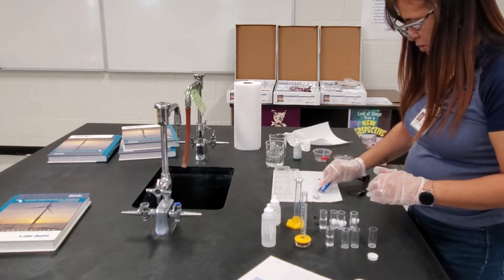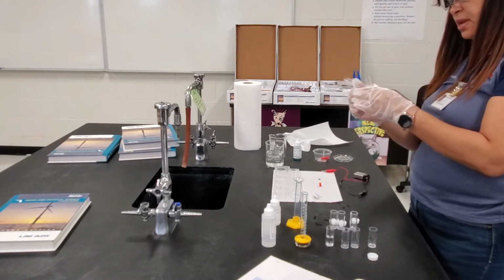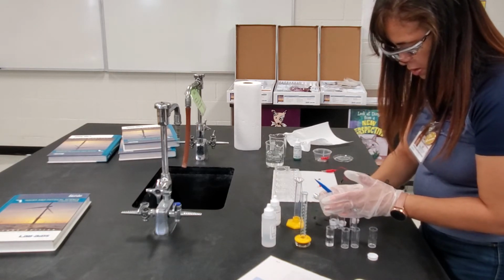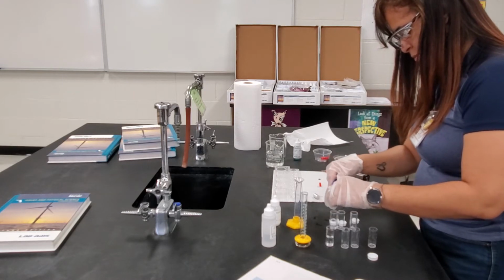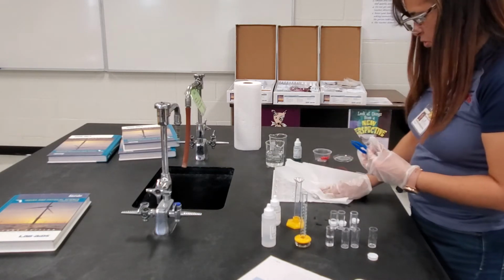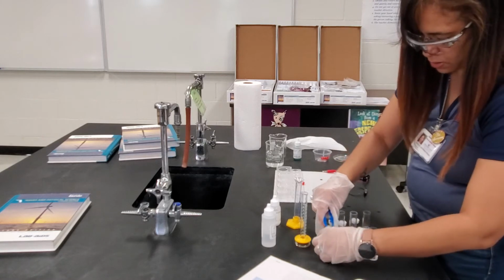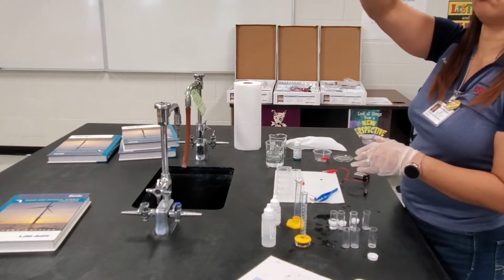We're going to repeat the step, first with water, with the second smaller metallic cylinder. And I don't think we need to cap it to realize it sank straight to the bottom. So we'll drain our water and then take our sample, and that one we want to make sure we dry completely as well. And then we're going to go ahead and place it in the ethanol. Woo, splash. We're going to have to add some ethanol to this. And it went straight to the bottom.